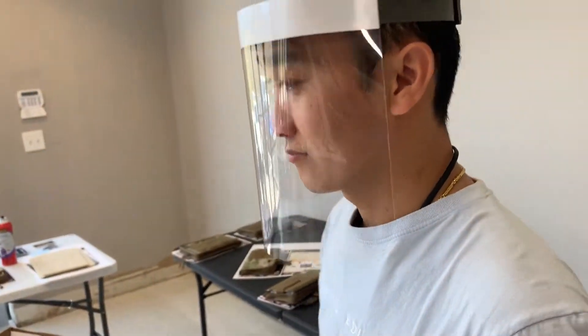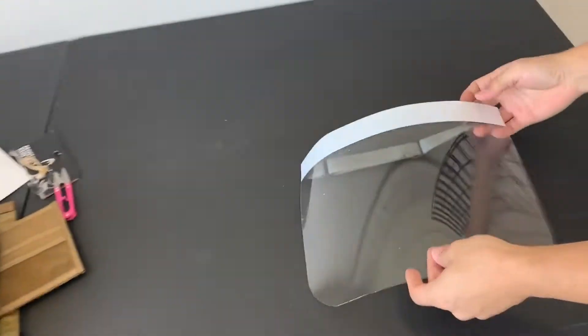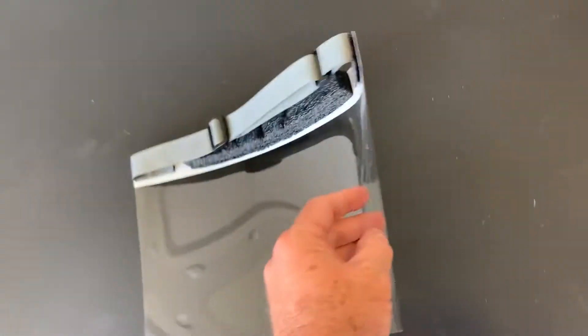And Kevin, if you could take it off — just showing you the inside. So as you can see, there's some substance to it. It holds its shape.